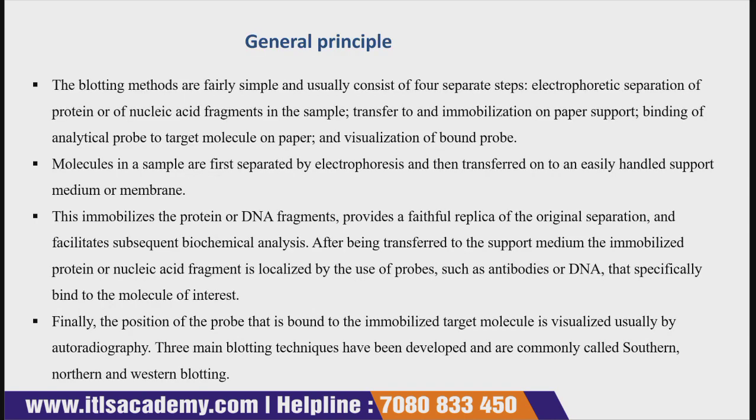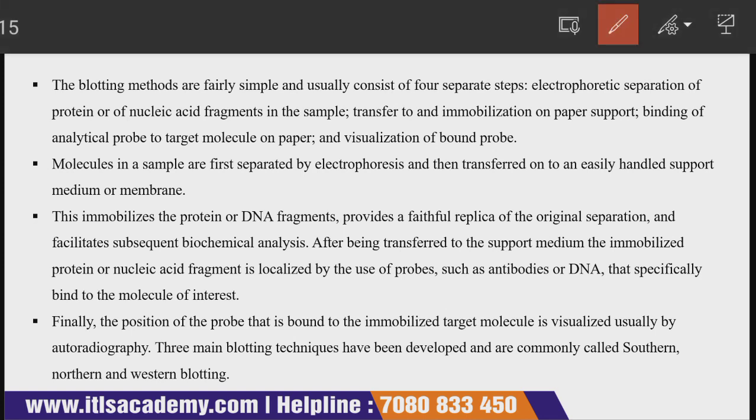So the blotting methods are fairly simple and usually consist of 4 steps. The blotting technique is very simple; it does not require any rocket science or any complex steps. It generally consists of 4 separate steps.